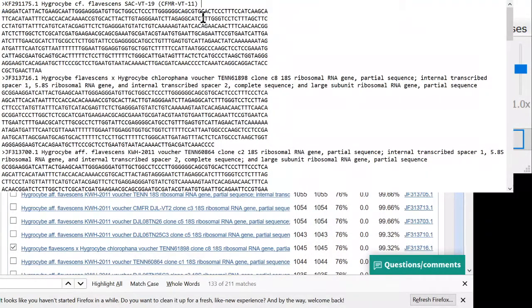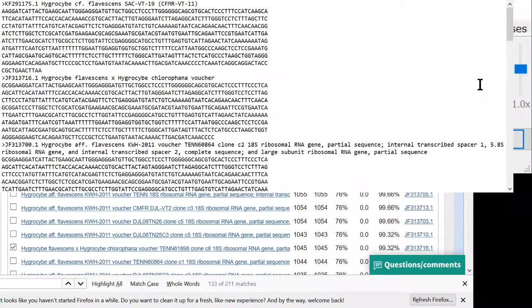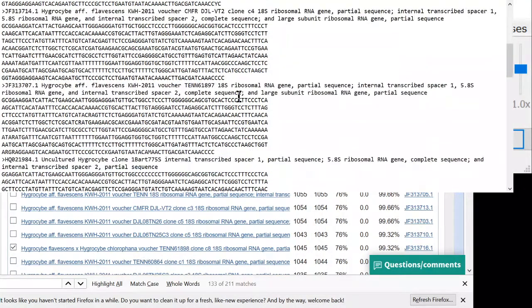And a really cool thing to do here is to put the location. So what I would have to do is look up this accession number and put the location. And when you have locations in your phylogenetic tree, that makes it much more useful. But it's also very time consuming to put in locations, so I will not do it right here. But if I was going to make this tree to upload to Facebook to share with my friends or publish in a scientific paper, I'd definitely put in locations because you get way more information out of it.